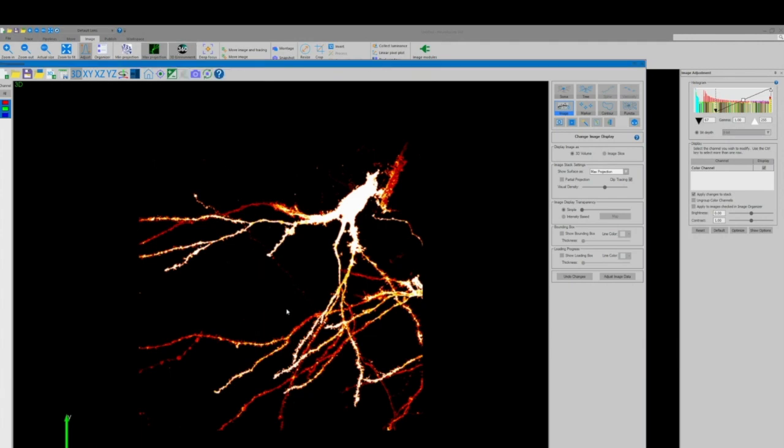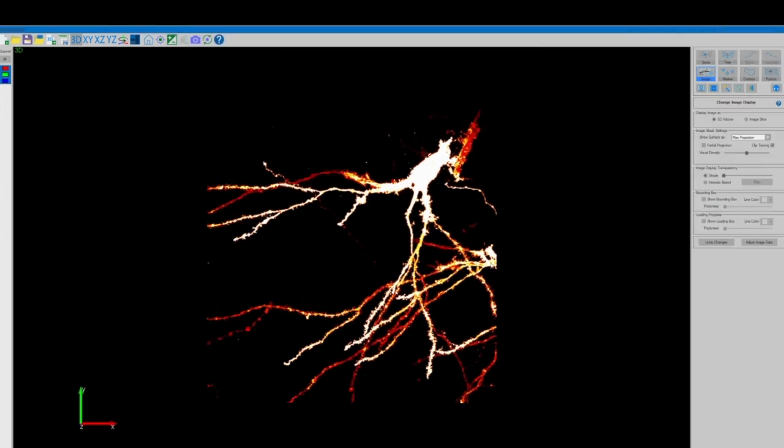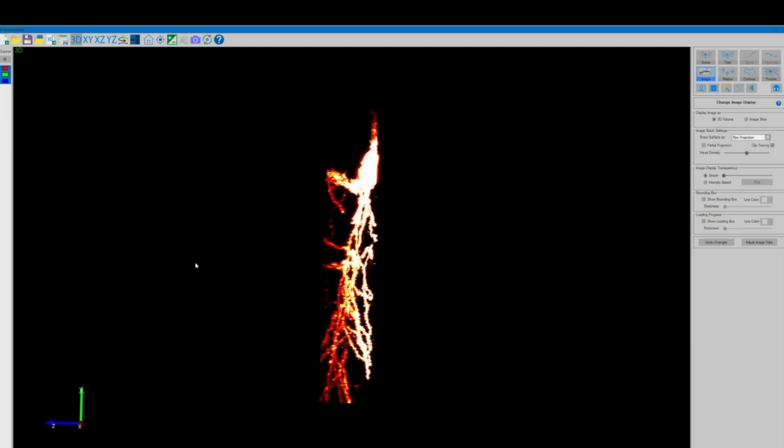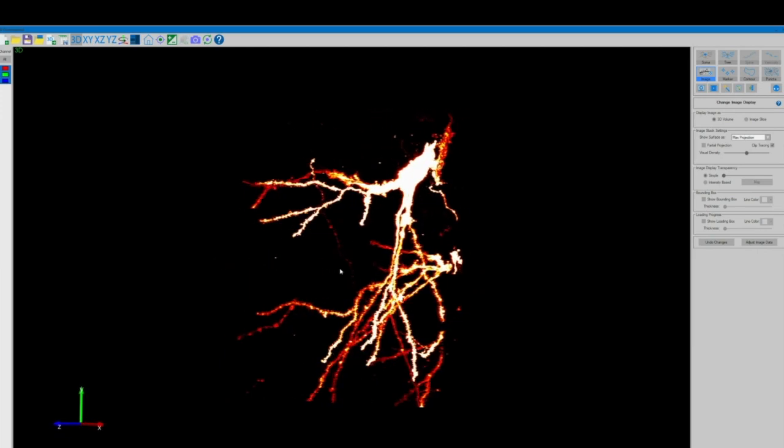And now going back into our 3D environment you can see just how much clearer our stack is without all that unnecessary background noise.